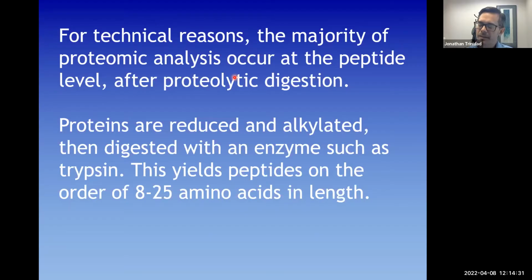Nevertheless, trypsin's not an ideal enzyme for all applications, and we often resort to a panel of other enzymes with varying specificities, such as chymotrypsin or Asp-N or pepsin, to really map out, in the case of individual projects that really want to focus on, let's say, one protein and all of its PTM states, we use a panel of enzymes to get there.